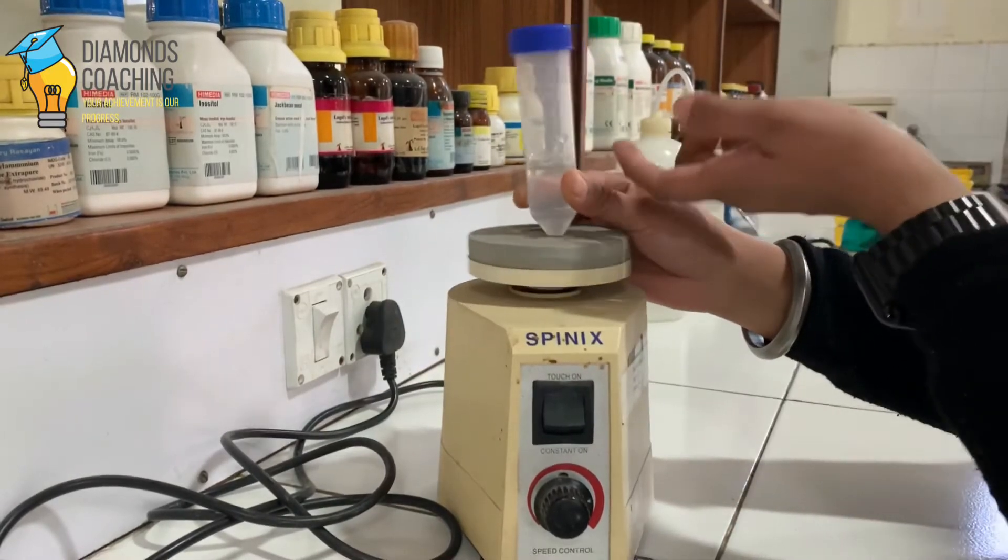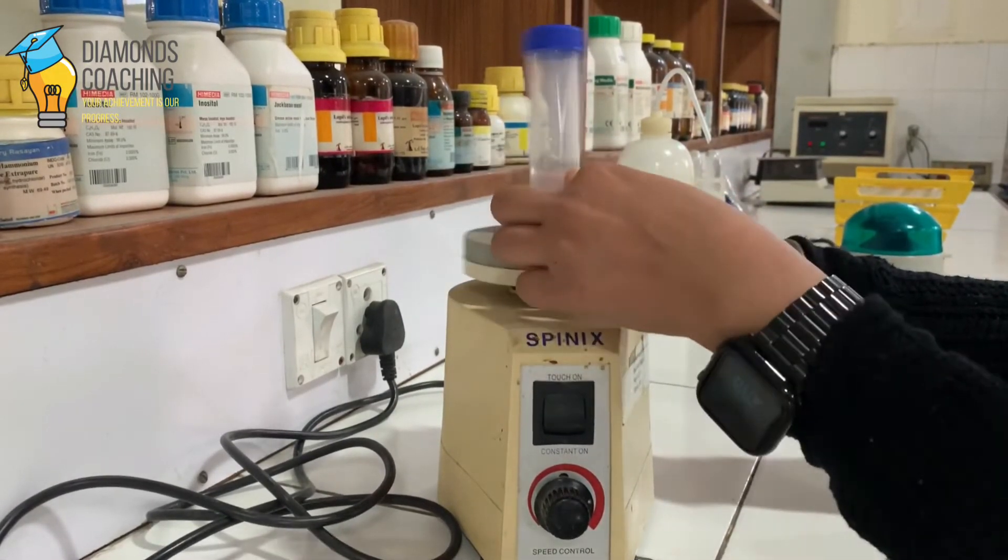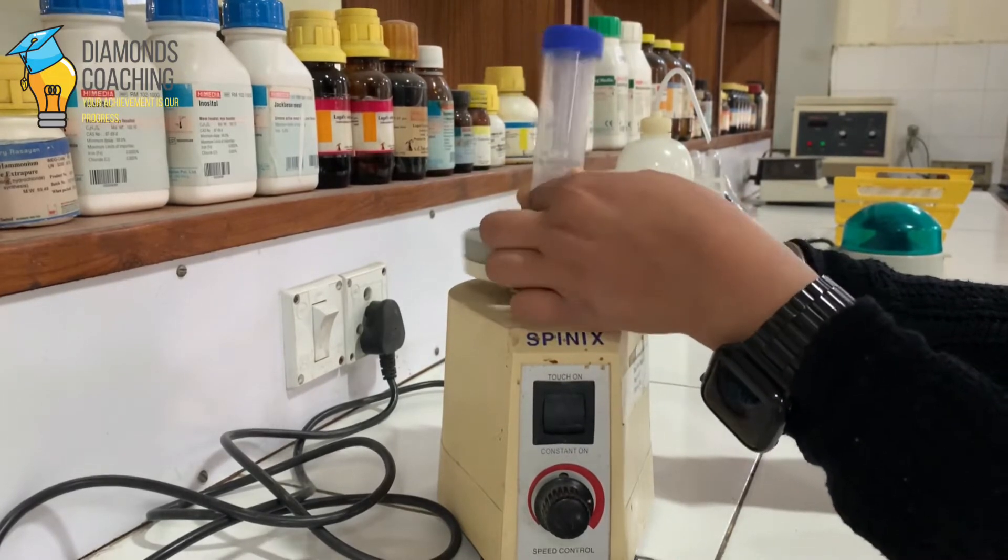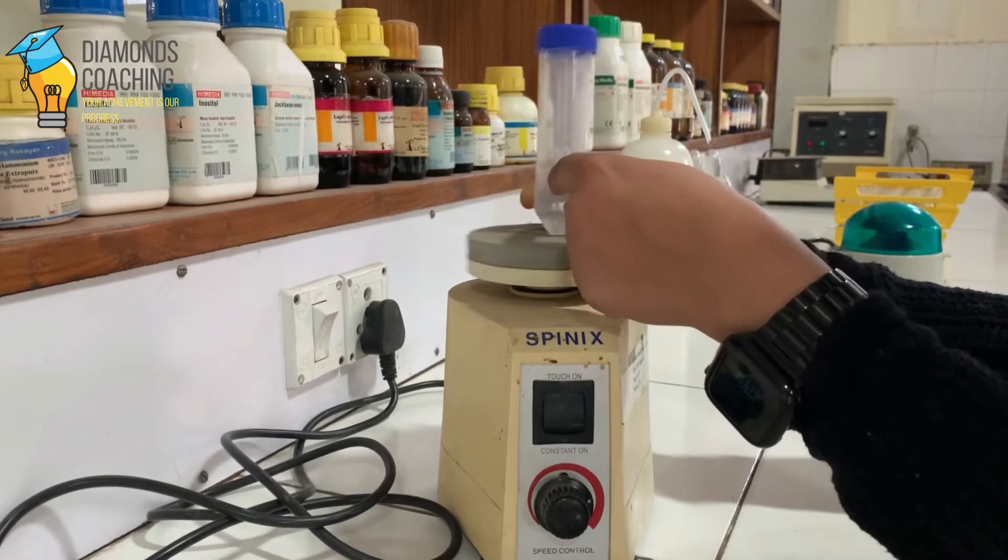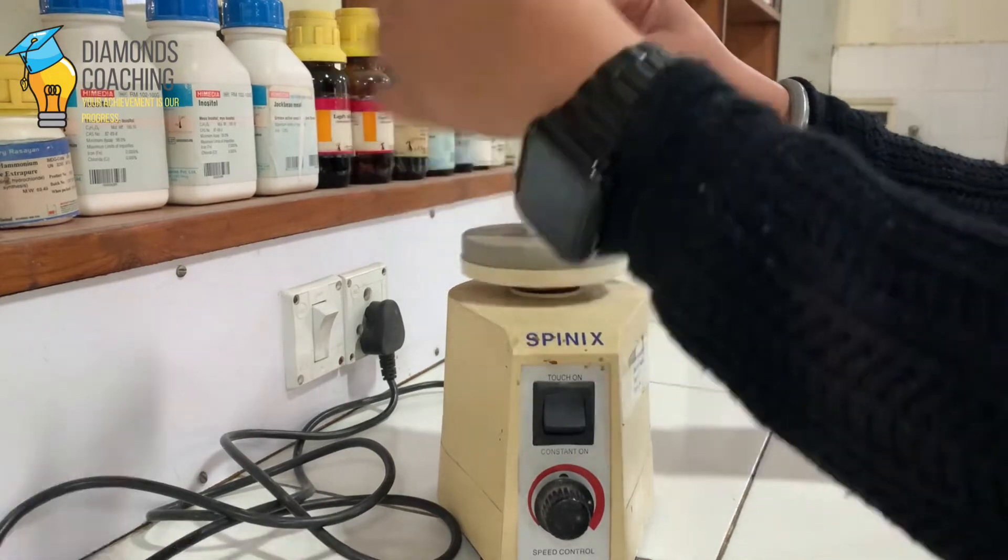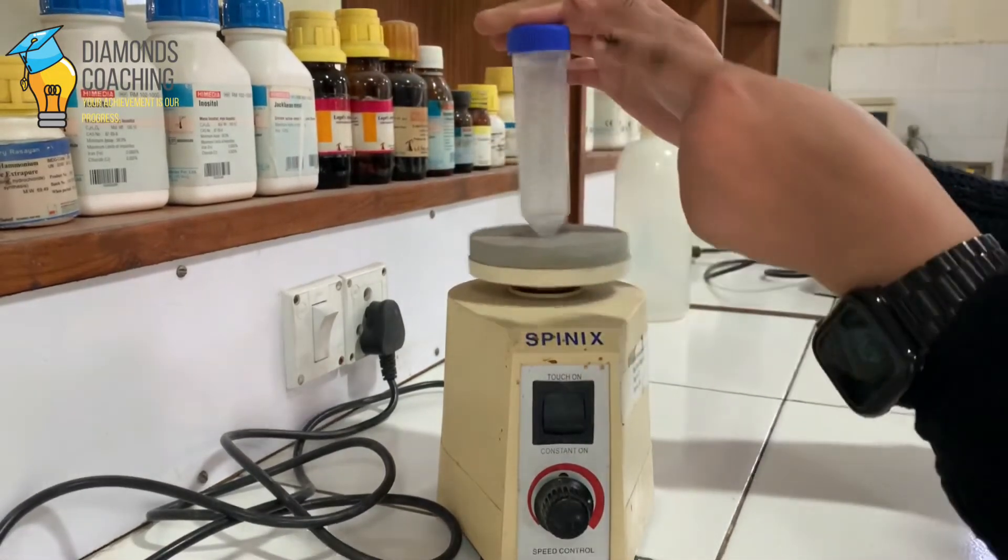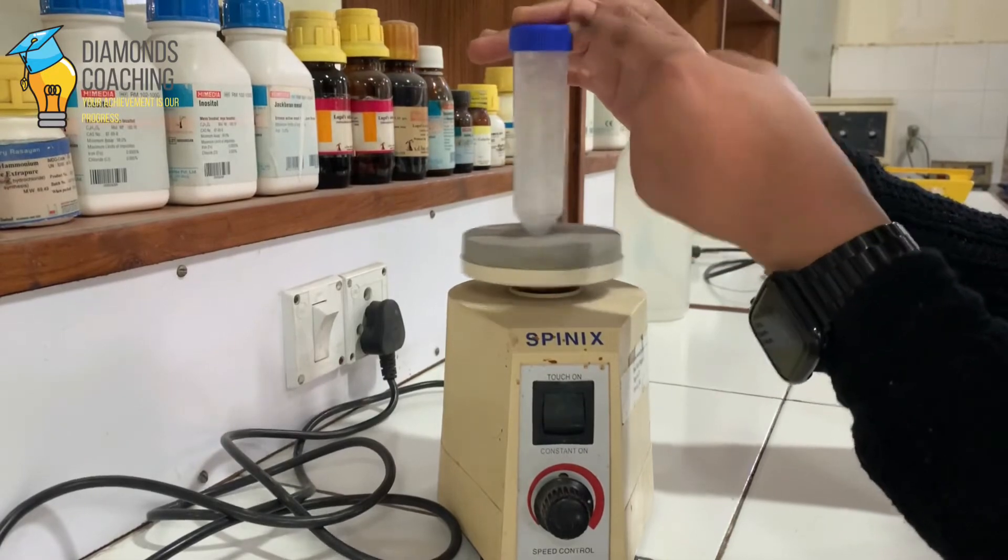So that if we want to mix the pellet from the lower side, then you should hold this vial from the lower side. And if you want to mix all the contents, then you should hold it from the cap or the upper side.